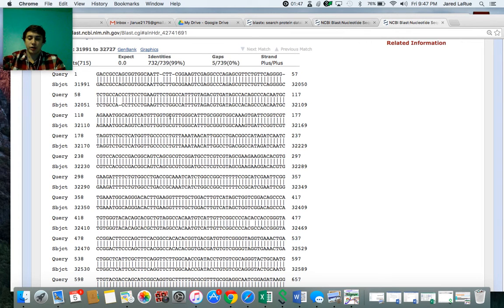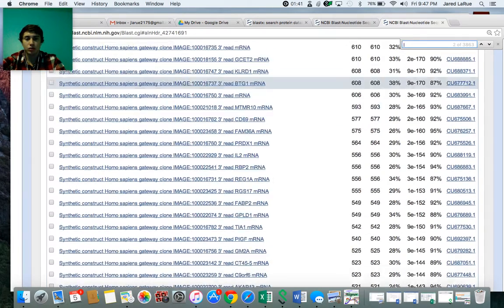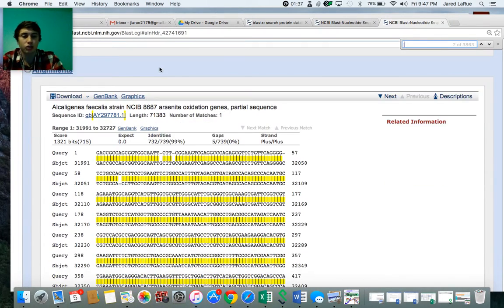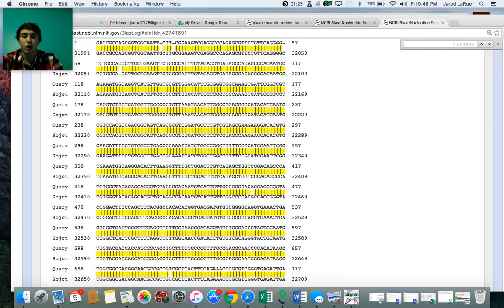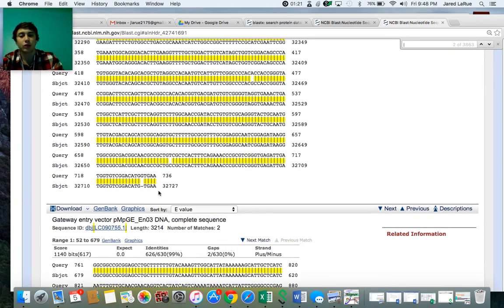And kind of a trick I learned. Let's see if it still does it. So if you do what I just did, if you hit Control Find to find on the web page, and then you type in this specific key. I would show you, but it's on the keyboard, obviously. It looks like this key right here. If you type that in, it's going to show you where all the matches are at. So it's a real easy way to find wherever your errors are at.